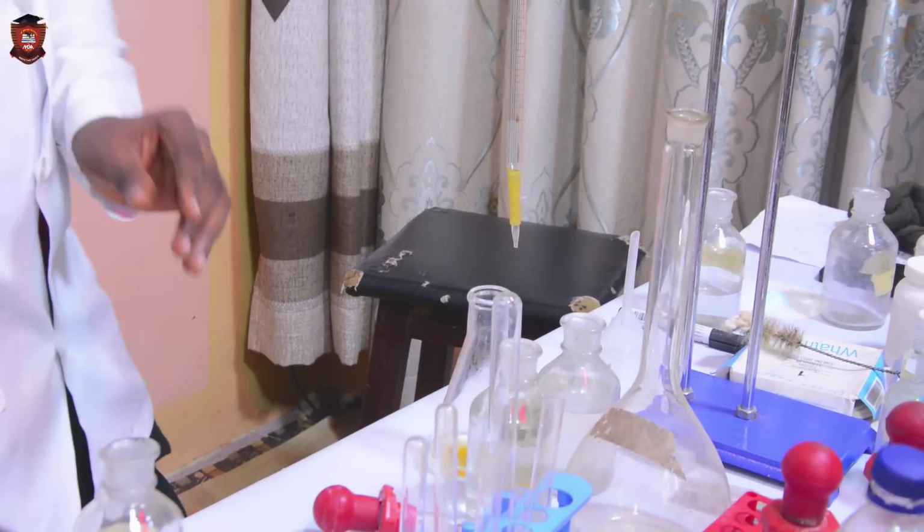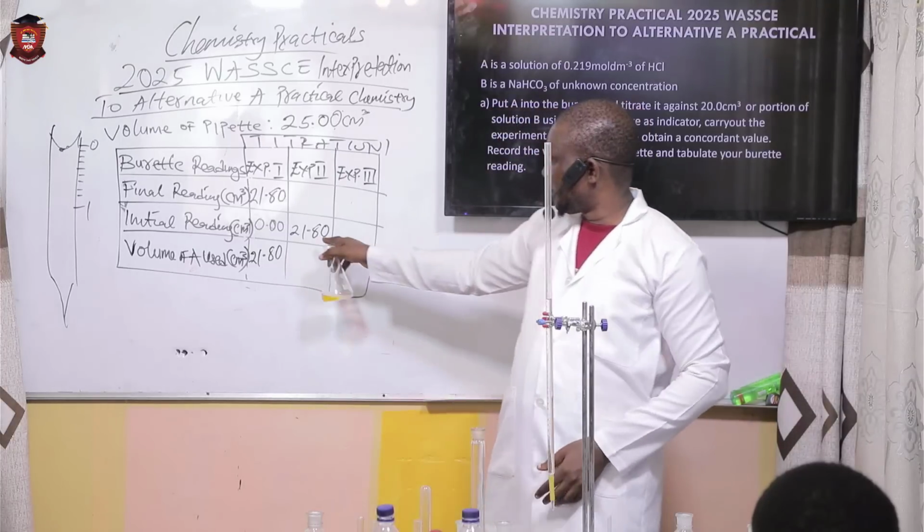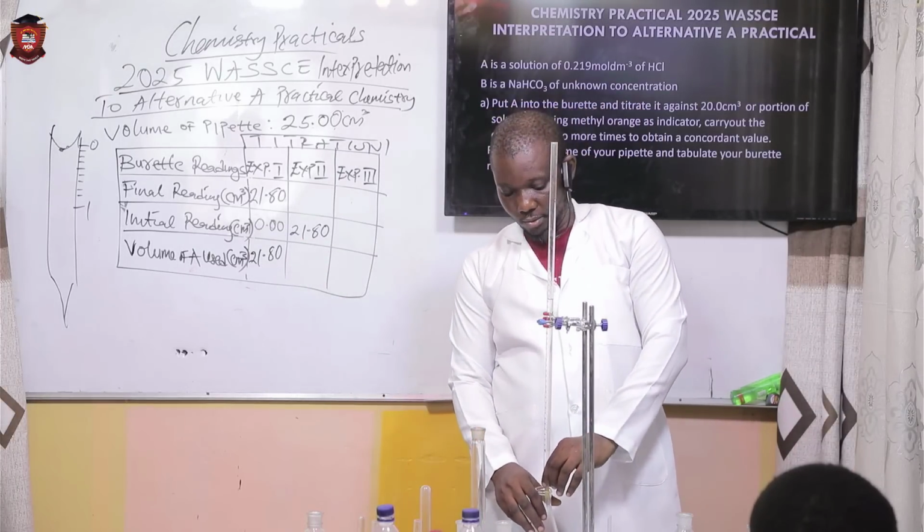Okay. To avoid overshooting, don't add 3 drops. Okay, now I've already recorded the initial. Now let's work it out.